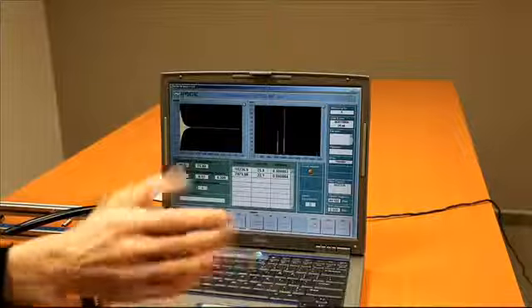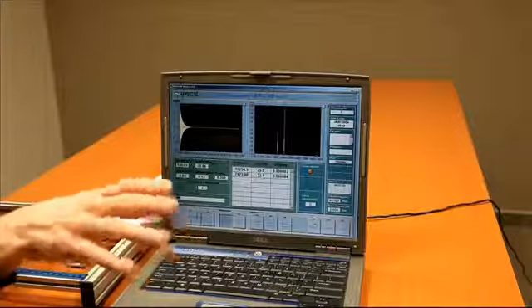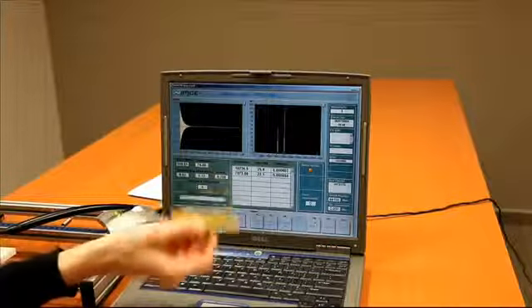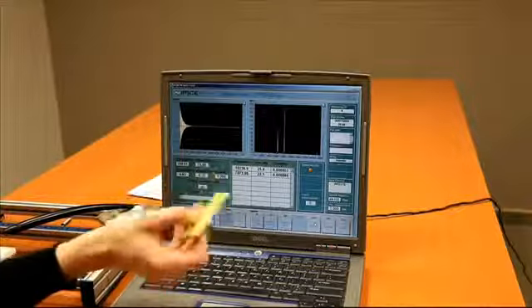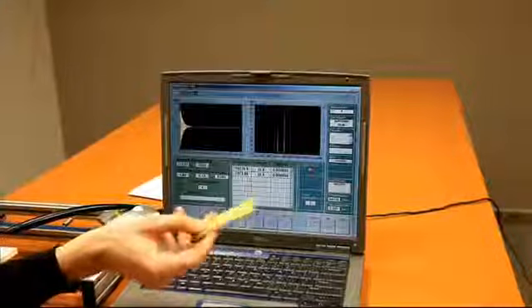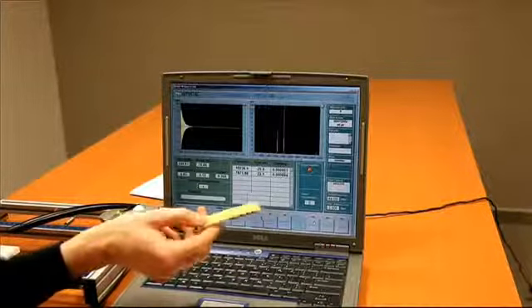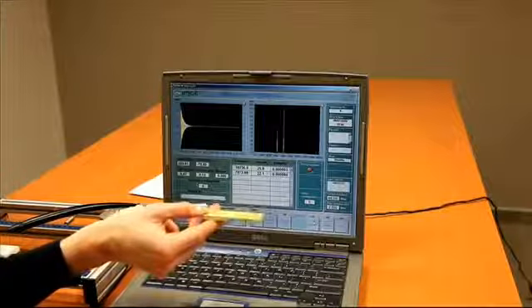Now, let's look at some materials. What's important is that the material is stiff enough, so that when we tap the sample, you have a vibration signal. Basically, you have to hear some kind of ping that you can record.